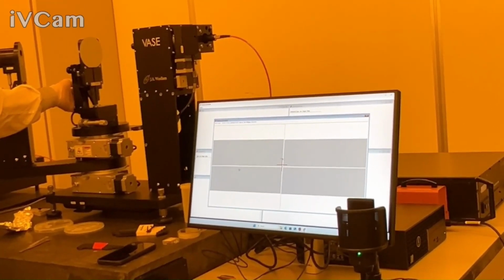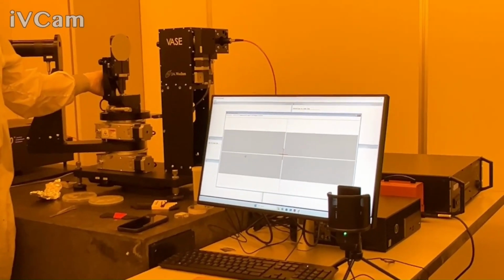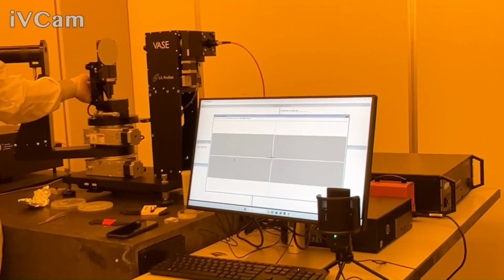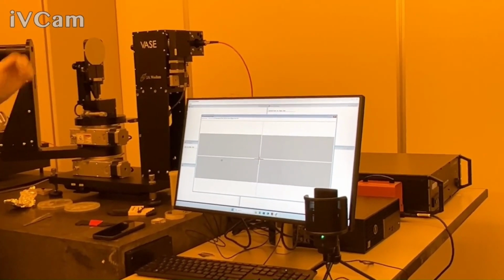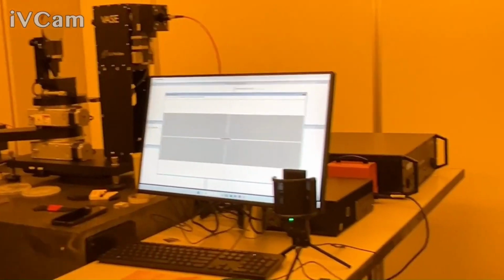I remember we used to do this. We got so used to doing it, you knew which direction. You could just do it within a few seconds. Like how you knew how much to turn and on which knob, pretty much. You'll get familiar. You're within a few units. That's good. I know it's tempting to always get it better, but you see it'll move a little bit by itself anyways. So that's good. You're good, within a few units.